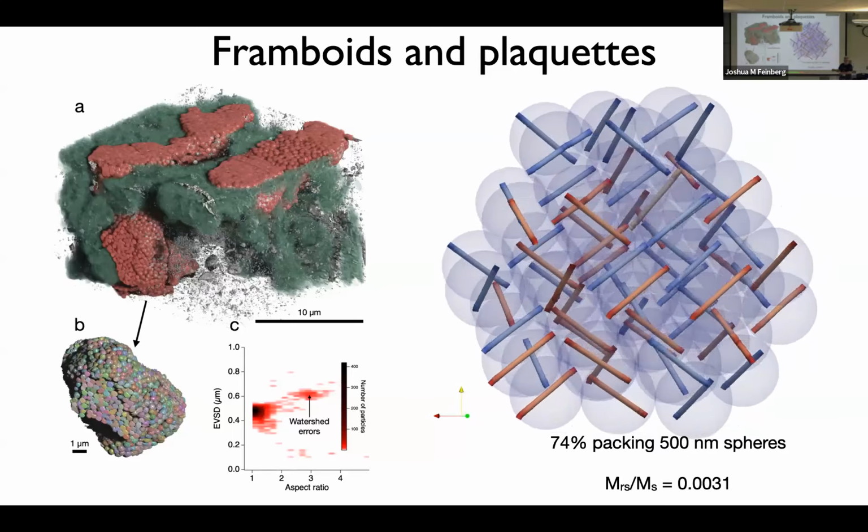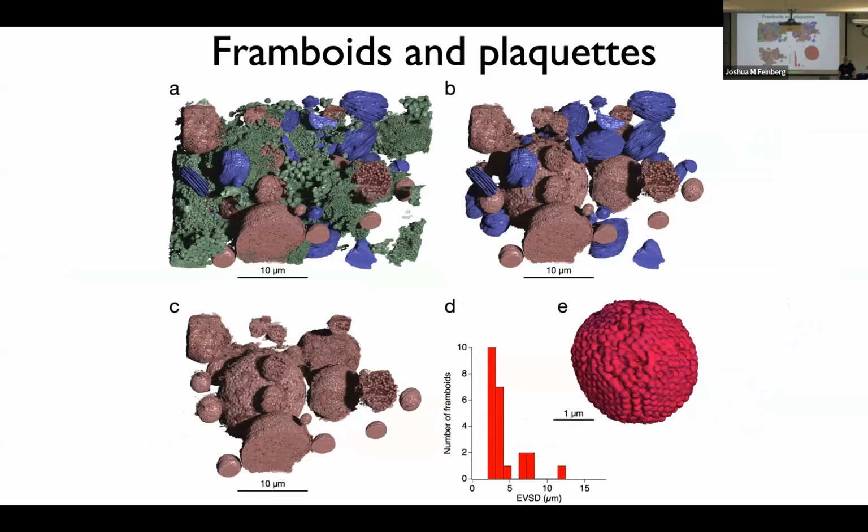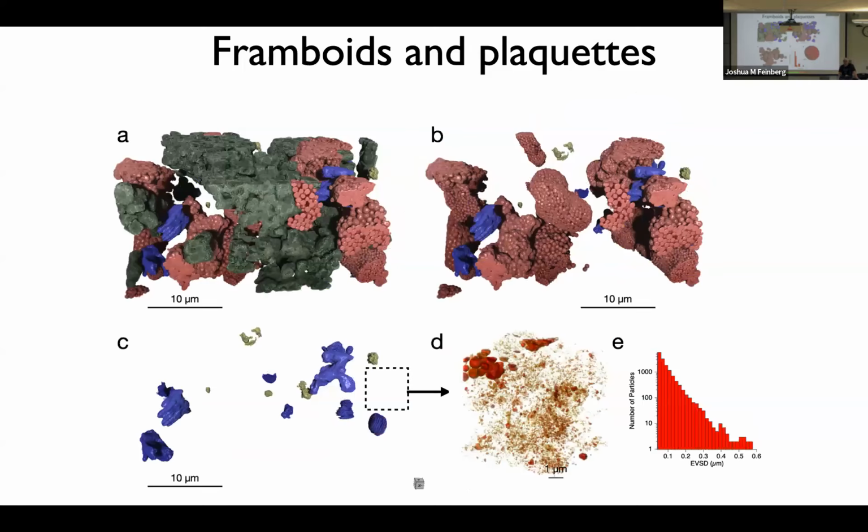So we can feed that into micromagnetics. Okay, and then we just do lots of pretty pictures. So yeah, framboids, plaquettes, and you can see the close packed nature of the framboid using this thing. You get the four 1-1-1 planes here. So you can start to see the symmetry, the fourfold symmetry of this thing. Okay, so these are very highly organized collections of very well-defined particles. But are they significant magnetically, paleomagnetically? That's the big question.